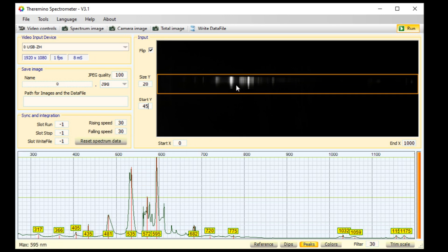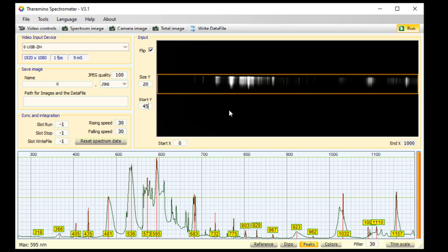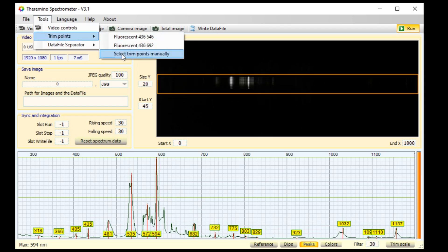Now turn on peaks and also turn off colors until we have calibrated. Note this double white line here and this single white line here — here's the double in the graph and the single in the graph. We'll do the first calibration on those. If your lines are much brighter and overexposed, put the light farther from the spectrometer and adjust the aim point. Then do Tools > Trim Points > Select Trim Points Manually.